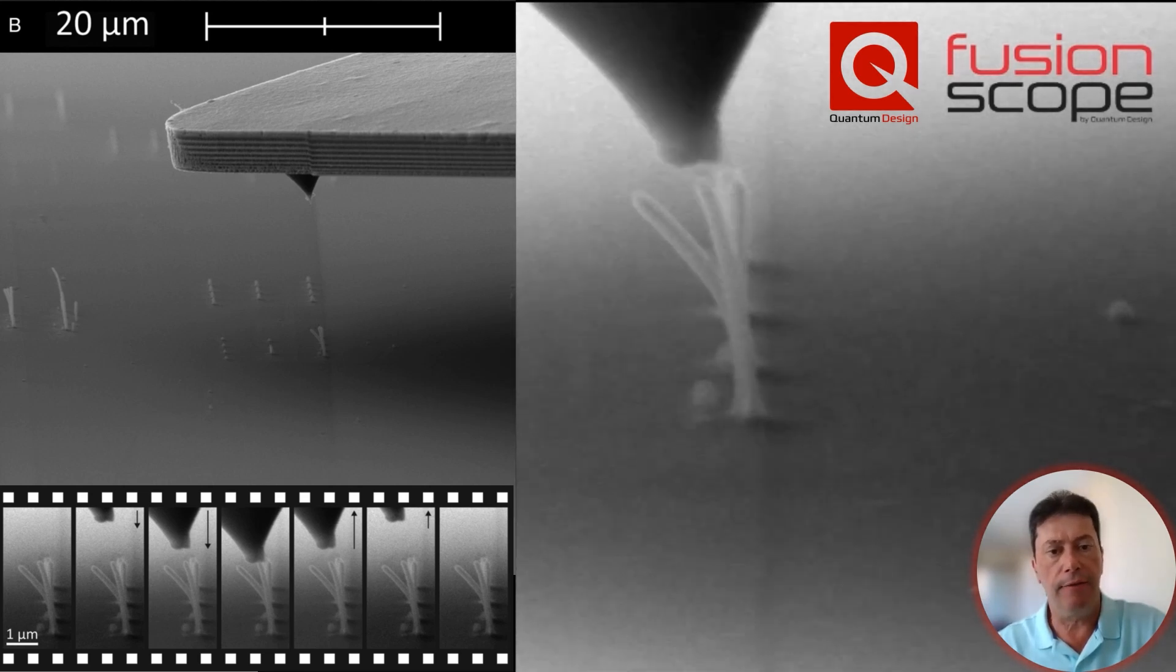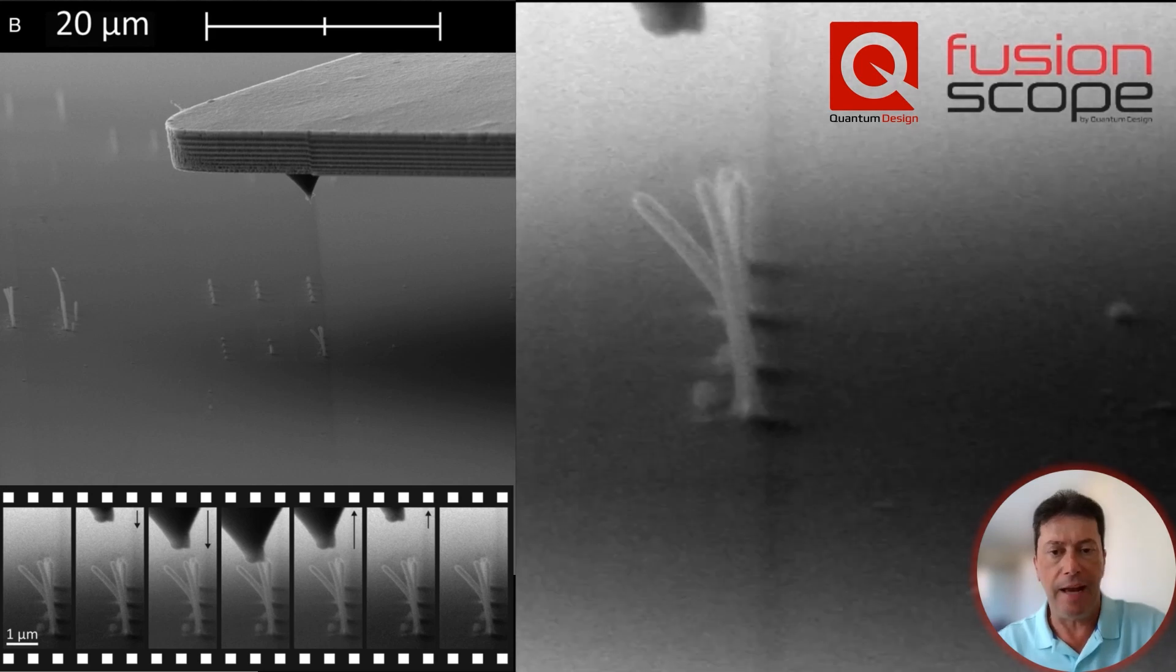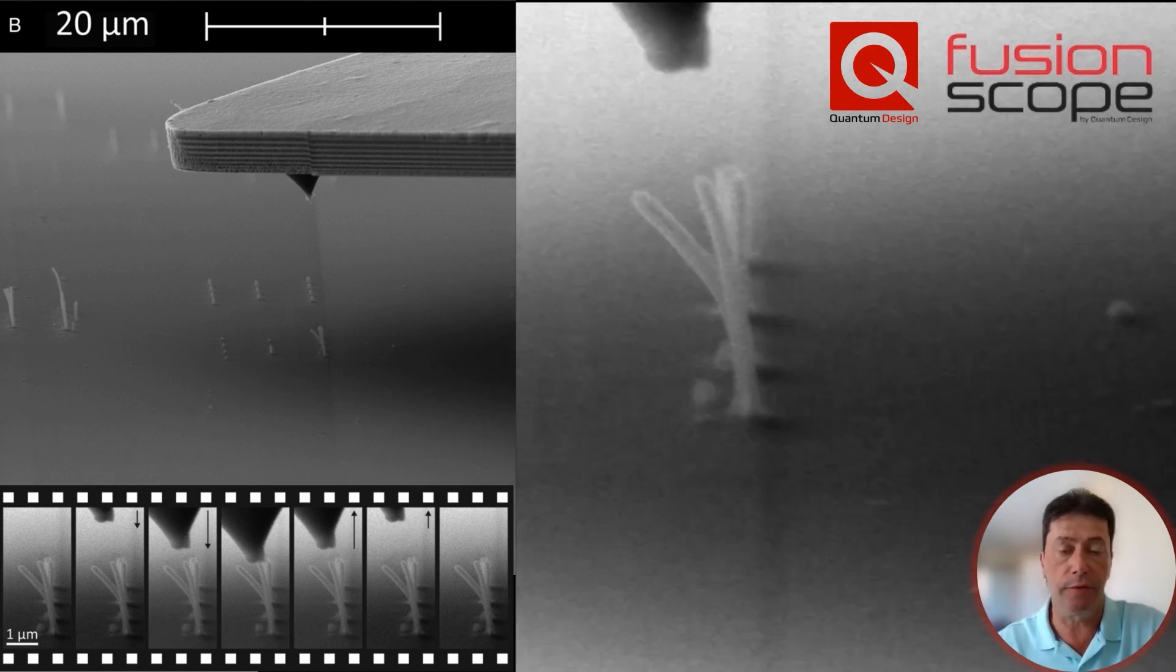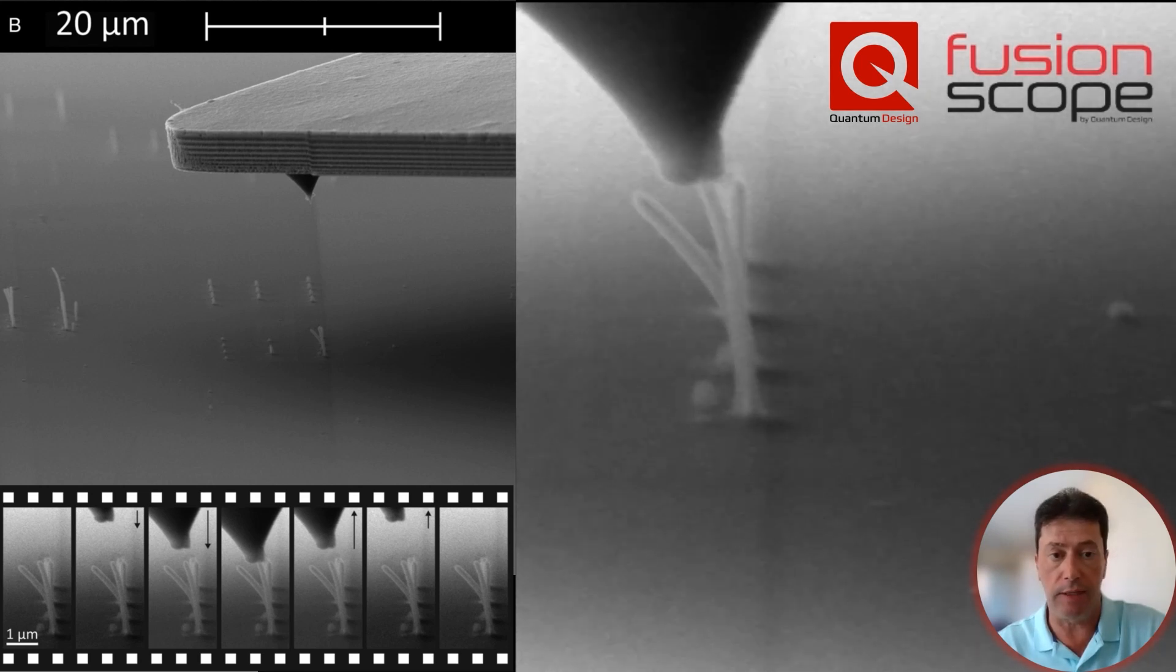Using an AFM cantilever as a force sensor, the nanostructure is a nanoplatinum pillar printed on a silicon surface using a focused electron beam induced deposition technique.